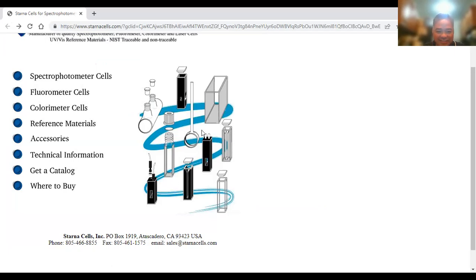So if we're going to look at the sample cell, first thing that you need is that it is transparent. Sa IR, kahit hindi transparent, okay lang. Okay. So what you have is either quartz or fused silica, for those if you want to go lower than 350. Or if it's higher than 350, you have glass or plastic for the visible region. So best if you have a flat cell with matched sample and reference cells.